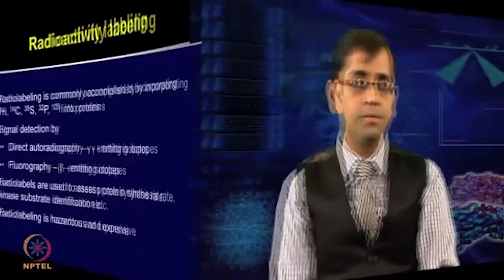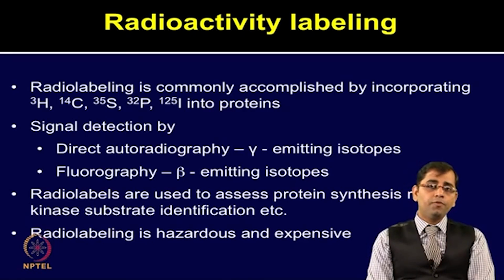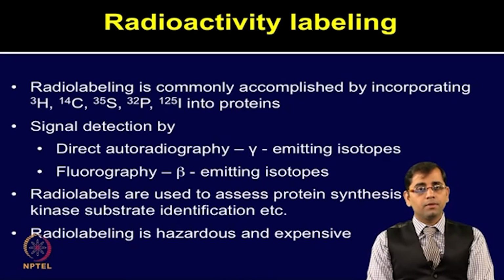There are various biological applications of radiolabeling like detection of antigen-antibody, protein-protein, protein-DNA and protein-RNA interactions on microarray surface, where binding can be studied through emission of radiation, on binding of query protein or antigen to the corresponding target molecule. In radioactivity detection, various types of radioactive molecules are used.